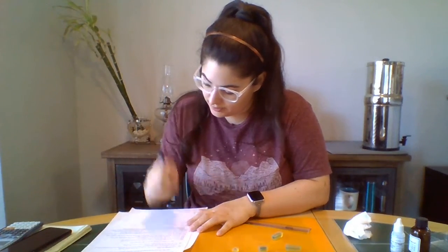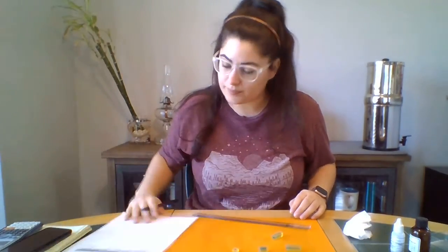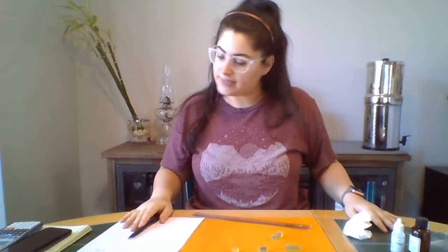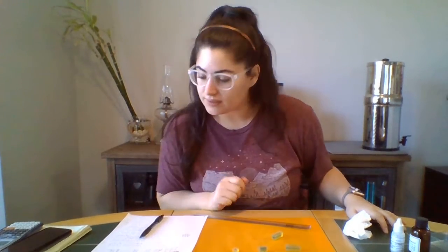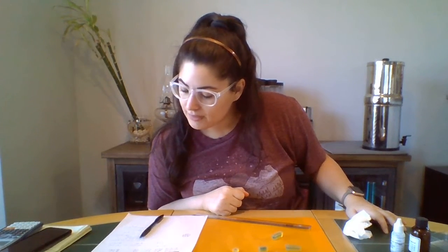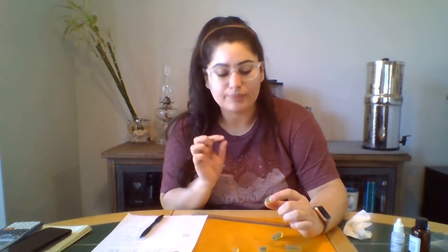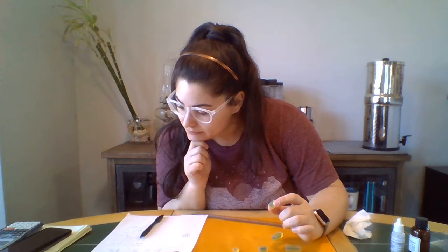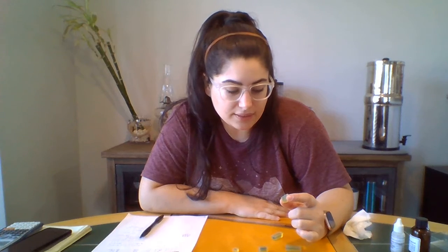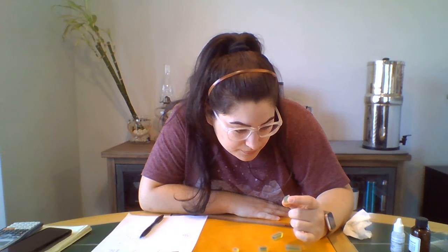Well, I think that was the last step. All right, well, that concludes this lab. I really want to know, though, was it all supposed to have the same distance of diffusion? Because this one, the measurement was just slightly different, a little bit greater distance. I wonder why that is. Or was I just not exact enough when I was cutting them? And that's why there's a little discrepancy. I don't know.